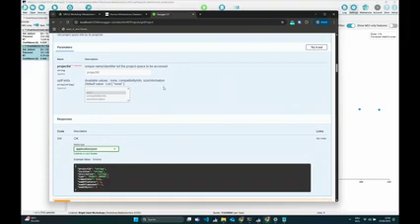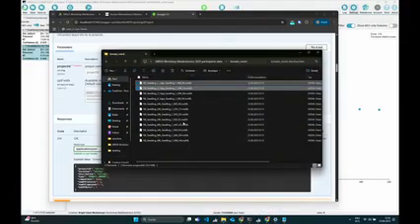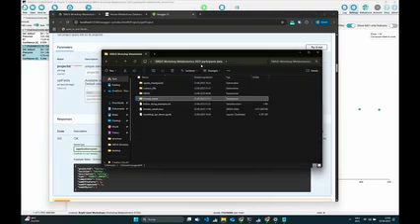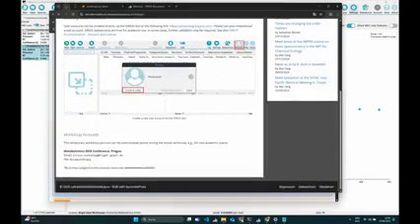But of course, many of you who do scripting would then script something in Python or maybe in R, and there's now an API available in Python and in R. And now let's look at this. There is another file in the files that were provided, and that is, if we go to the top folder, this workshop API demo.ipynb, so this IPython notebook. Yeah, you might be able to just double click on it to open this if you have IPython installed, but I just want to show this very briefly.